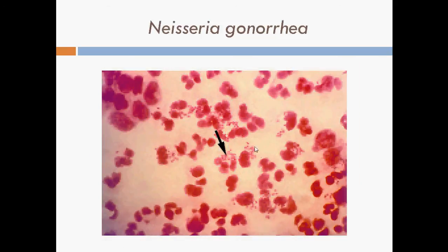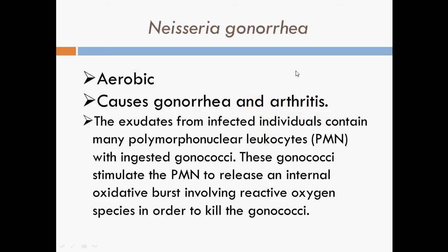Here we have Neisseria gonorrhoeae in the microscopic view. Neisseria gonorrhoeae are aerobic and cause gonorrhea and arthritis, which is inflammation of the joints. The exudate from infected individuals contains many polymorphonuclear leukocytes, or PMNs, with ingested gonococci. These gonococci stimulate the PMNs to release an internal oxidative burst involving reactive oxygen species in order to kill the gonococci. PMNs, or polymorphonuclear leukocytes, are granulocytes with varying shapes of nucleus.